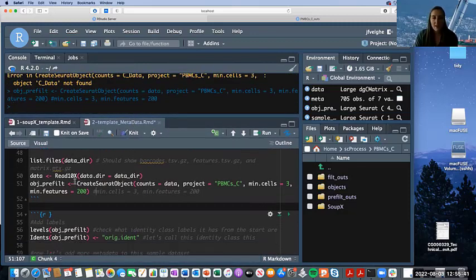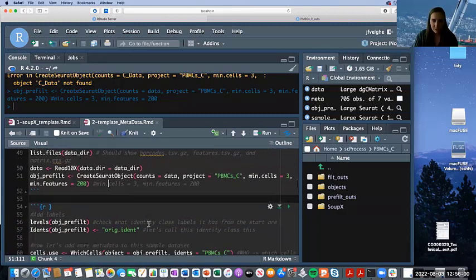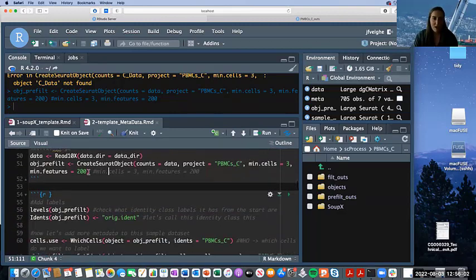In the past, getting from our Cell Ranger count outputs to here was a very complicated process that has become a lot more streamlined as the Seurat package for single cell RNA sequencing has been updated and made better. So now it's become a much simpler process. And this is pretty standard to set these thresholds as such.